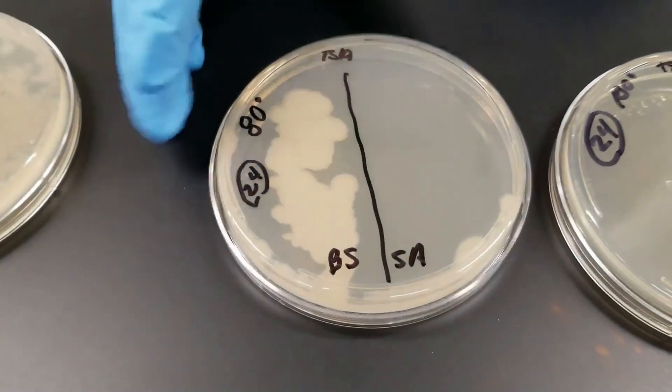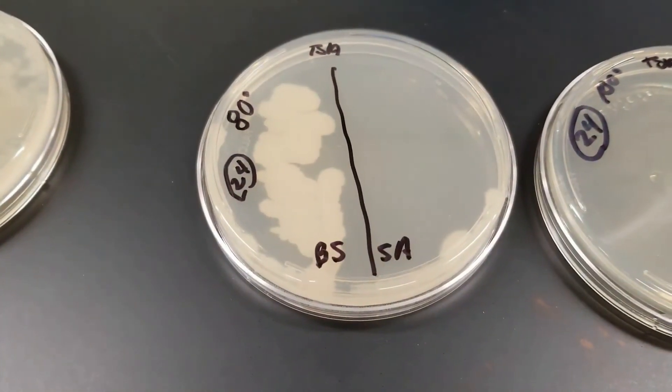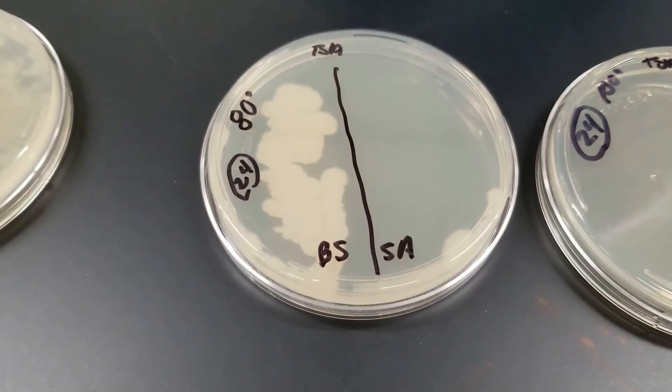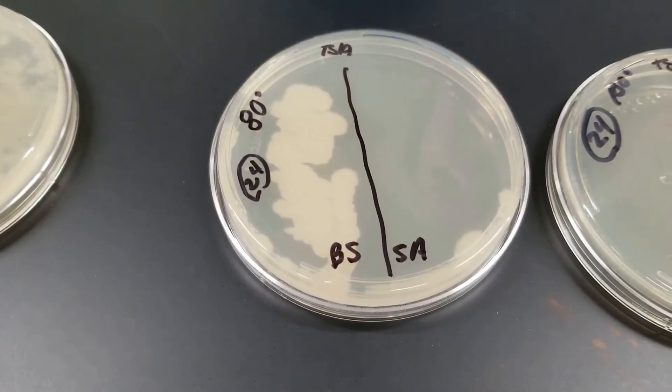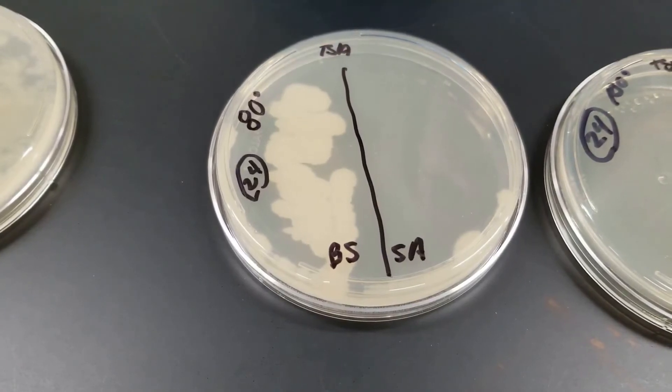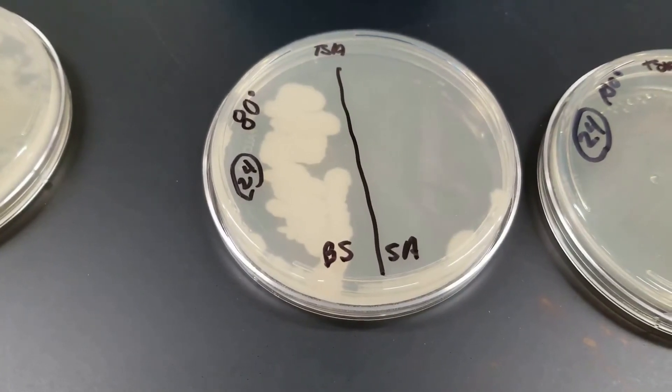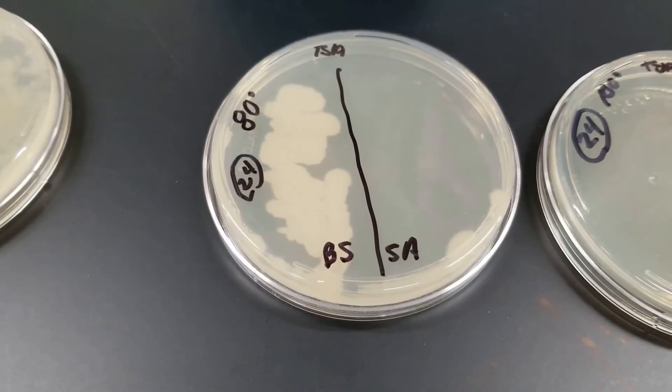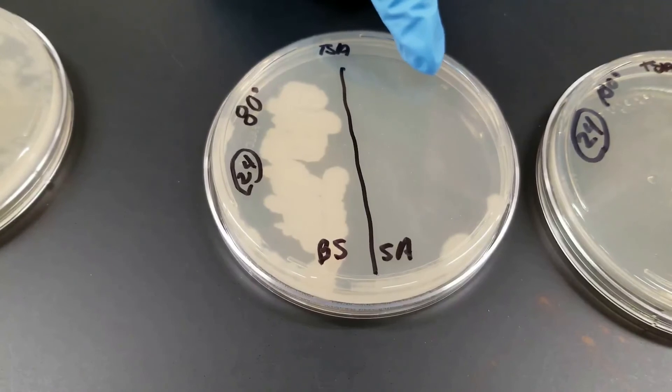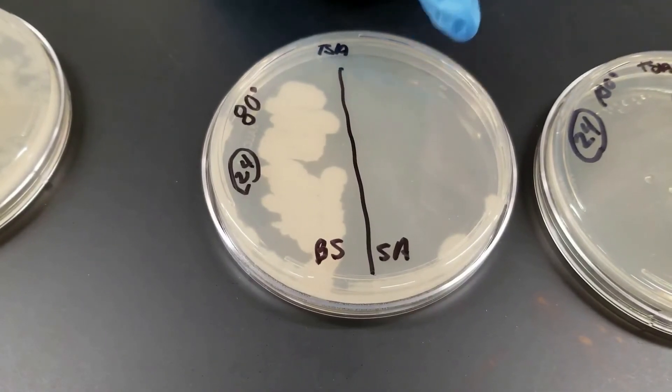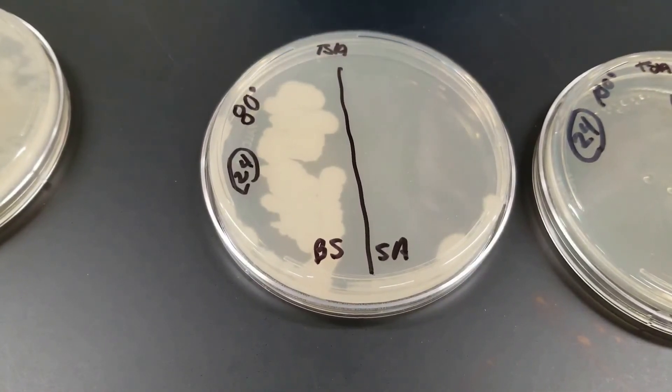This third plate is at 80 degrees Celsius for 10 minutes. So the cultures, once again, were put in a water bath at 80 degrees for 10 minutes and then streaked on the plate. As you can see here now, you're seeing the difference between the two bacterial species. Staphylococcus aureus did not grow at all. At 80 degrees, it was killed.